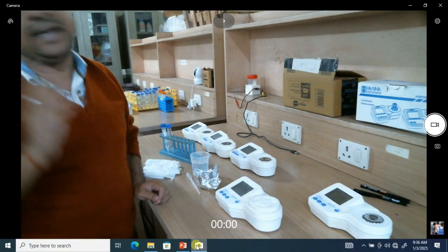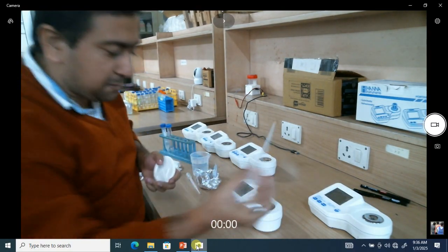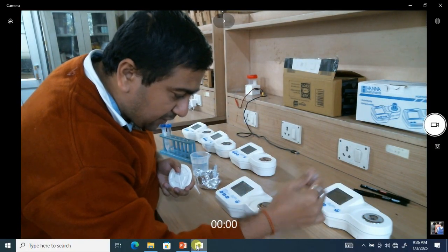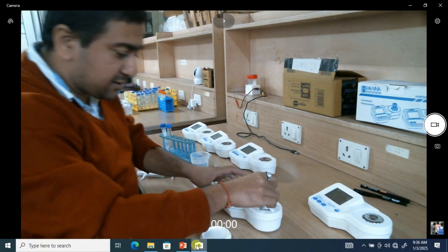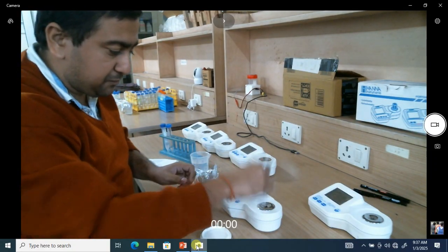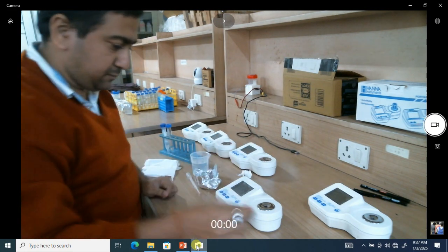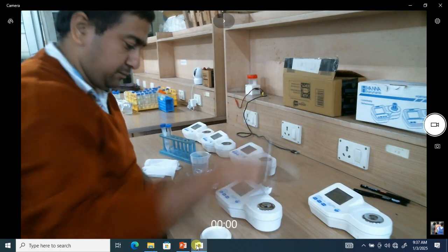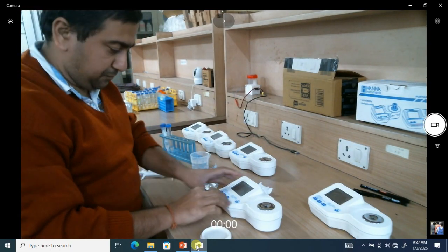Simply, with the help of another dropper, we will take the solution out, and we will wipe off gently with a tissue paper. Don't rub it too much. Just put the tissue paper near the solution and it will soak it. Don't rub, otherwise the crystal will be damaged. So in this way we can measure the ND.